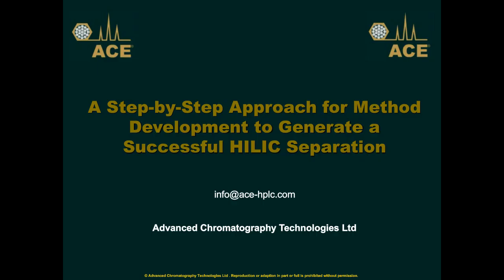Thank you very much indeed for that very kind introduction. I'm very grateful for the opportunity to present today and thank everybody who has signed in to listen to the presentation. So it is about HILIC. It's about hydrophilic interaction liquid chromatography.